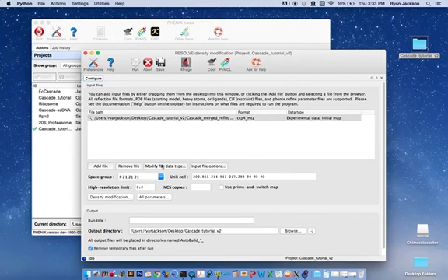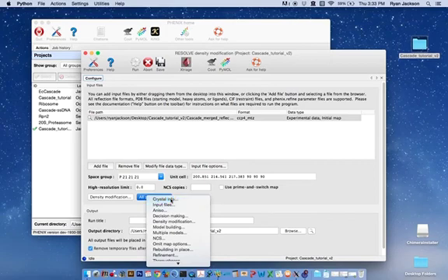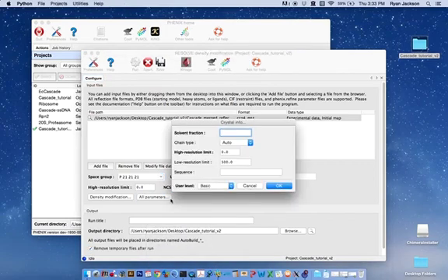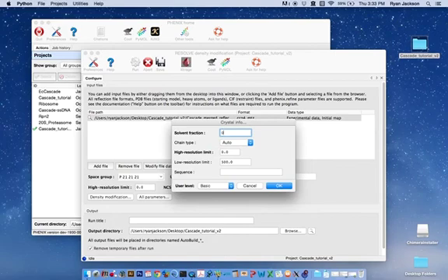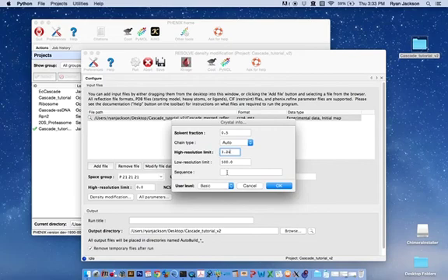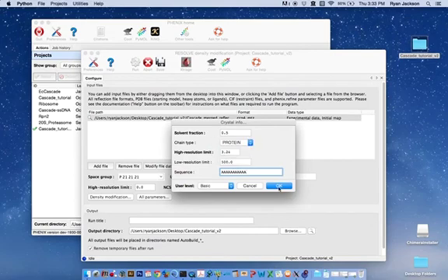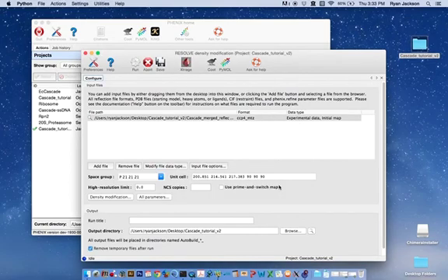Now, we need to change some of the parameters under here in the All Parameters button. Crystal Info. The solvent fraction of the cascade crystals was determined by Matthew's coefficient calculator to be about 0.5. The resolution limit of this data set is 3.24. And the sequence, all that needs to be placed here is a string of A's. It just needs some information there but it doesn't need to be accurate. Then the chain type will just say it's protein and hit OK.